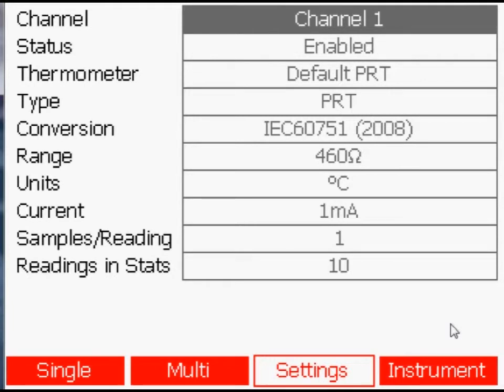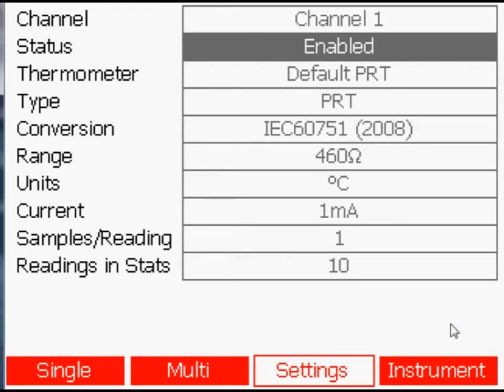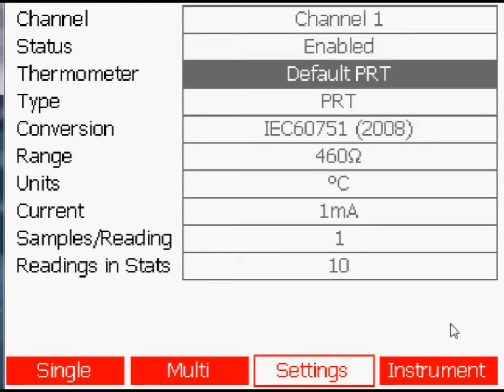In addition to default thermometer types, the MillerK has a database for user probes with custom calibration data.